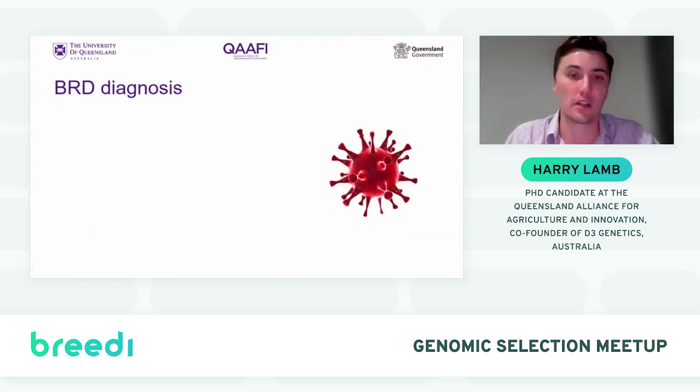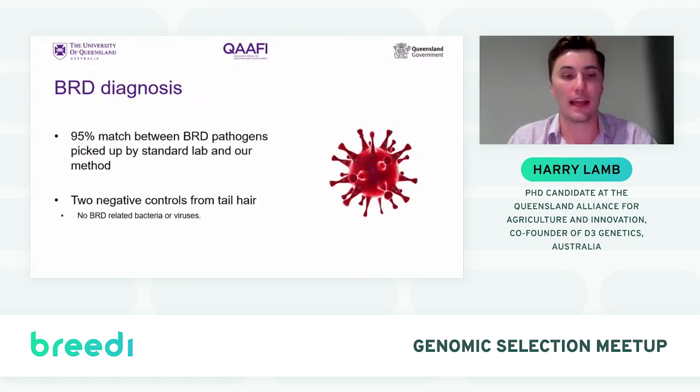Next, we looked at the bovine respiratory diagnosis. We actually got a 95% match between the different bovine respiratory disease pathogens that we picked up using our method and the pathogens that we detected when we sent the samples away to the lab.